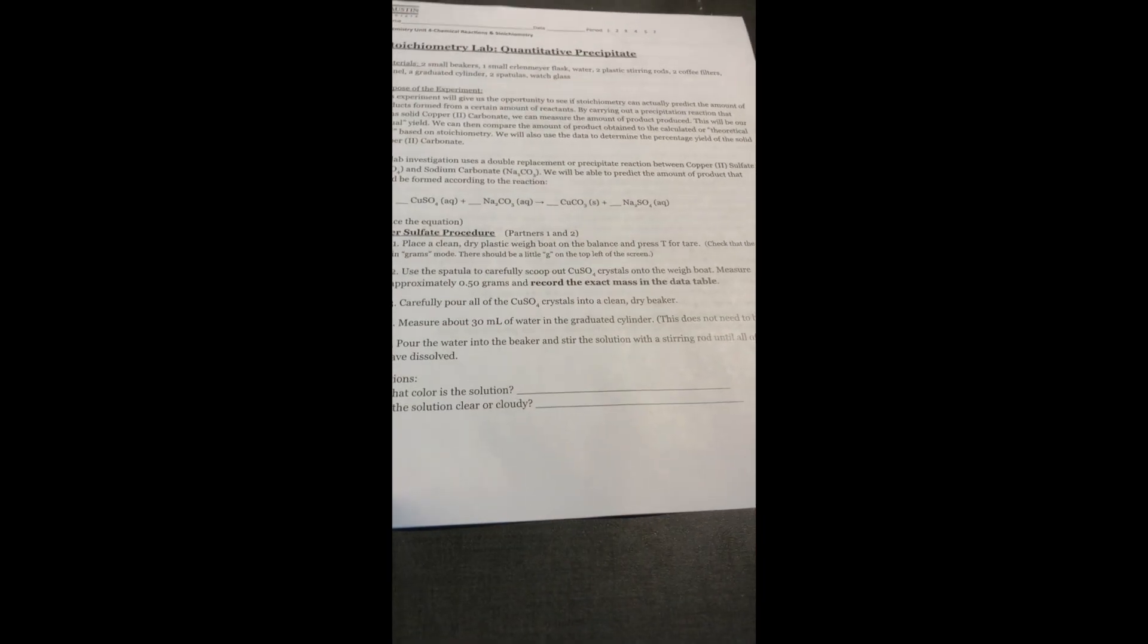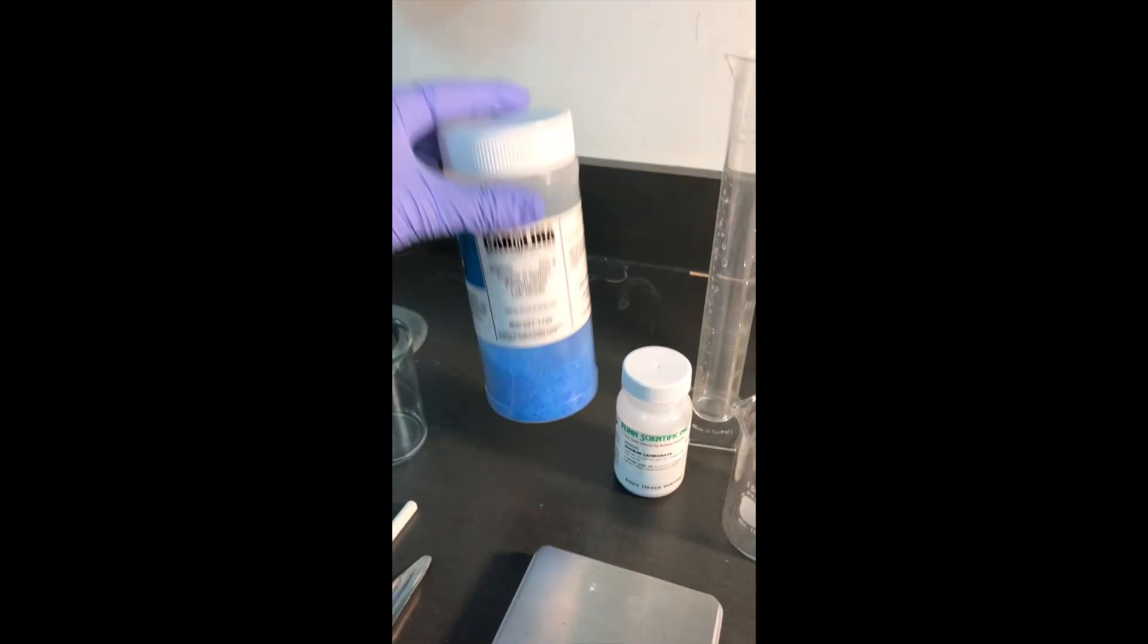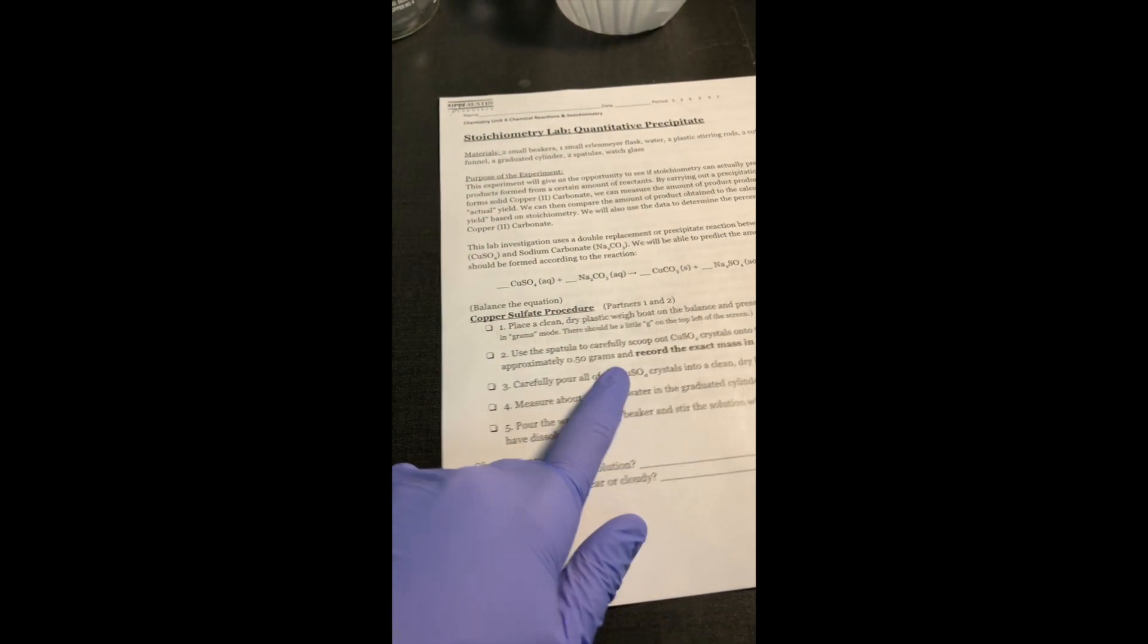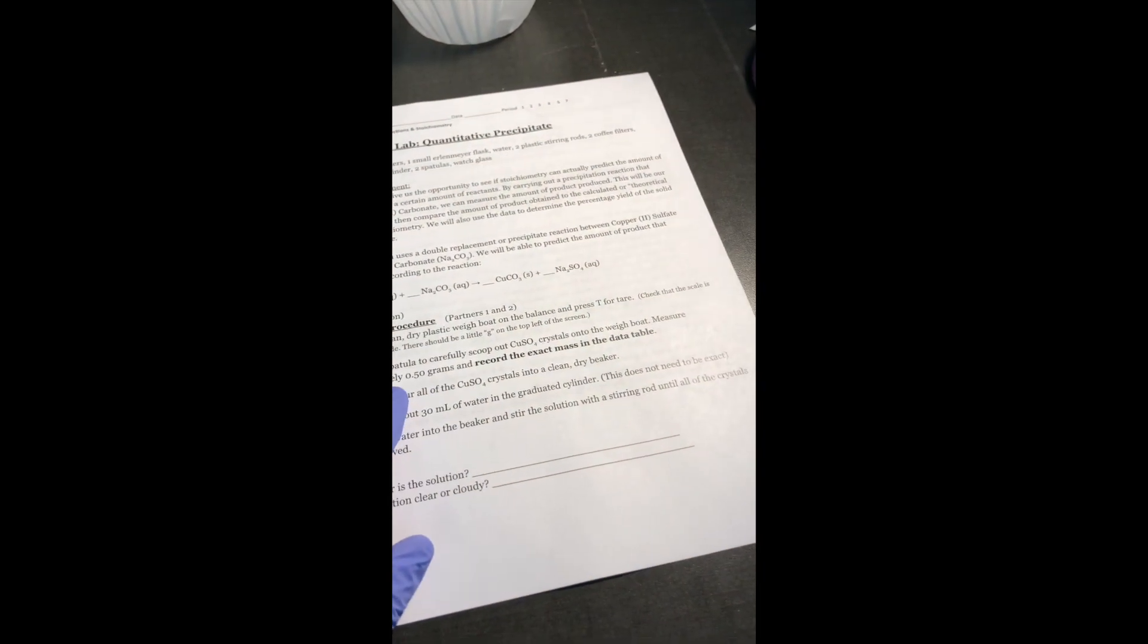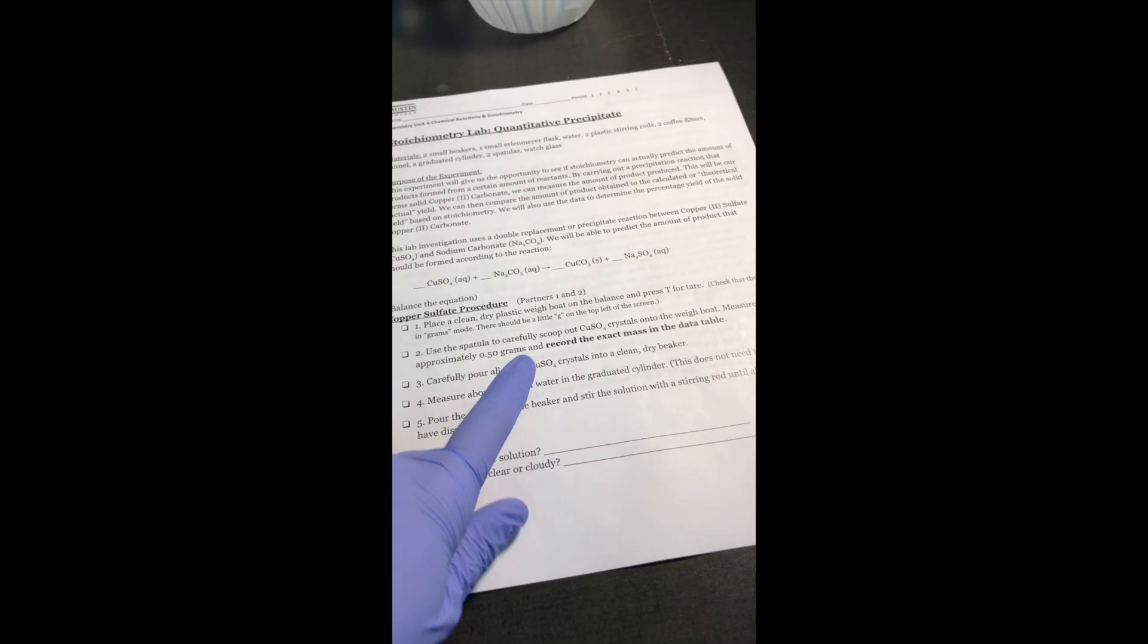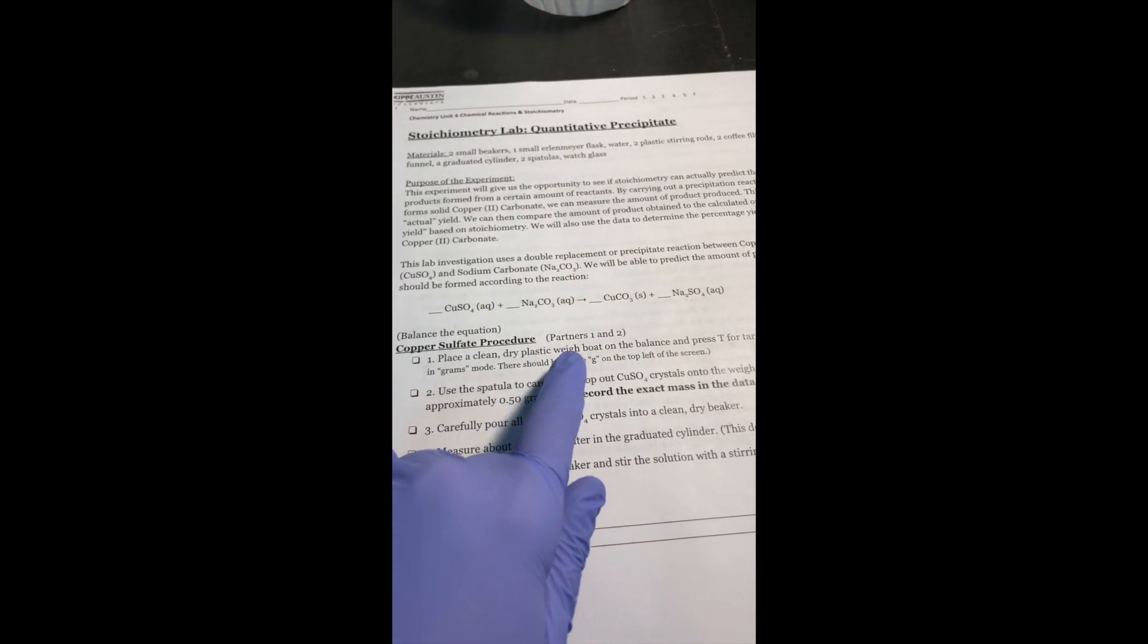The first part of the procedure is how to make the copper sulfate solution. So that is these lovely blue crystals. We're going to make a solution with about half a gram of copper sulfate. It says about or approximately, so we're going to get as close as we can to 0.5 grams and then we'll record the exact mass in the data table. First, we're going to place a clean, dry plastic weighboat on the balance and press T for tare.